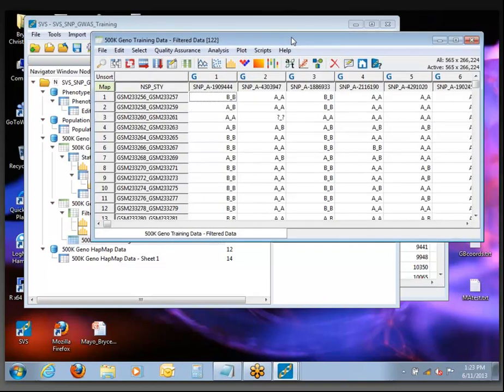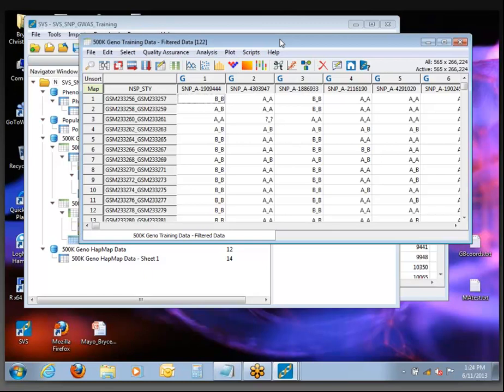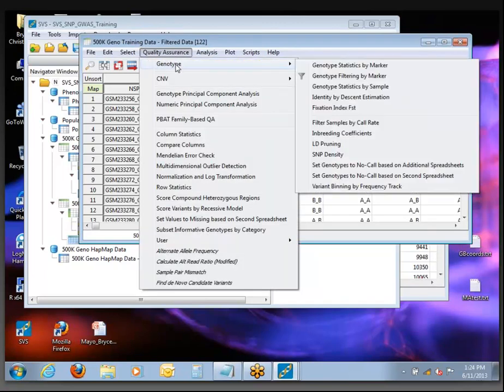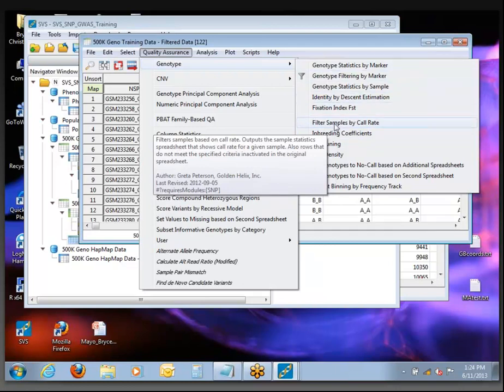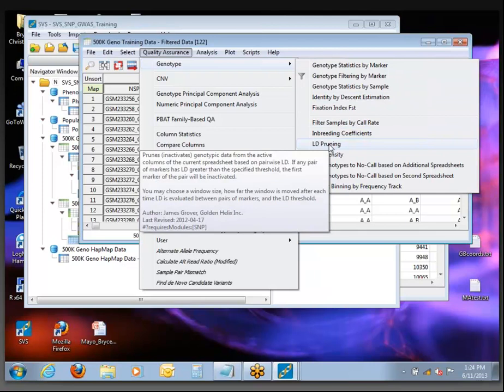The next step in the process is this LD pruning step, which we did this morning. What it does is go through all of these SNPs and find the ones that are independent — the ones that aren't necessarily correlated with their neighbors. This one could take a few minutes — it's in the Quality Assurance menu again, under Genotype. I tend to use this menu a lot in GWAS analysis. The quality control steps often take more time than the actual analysis steps.